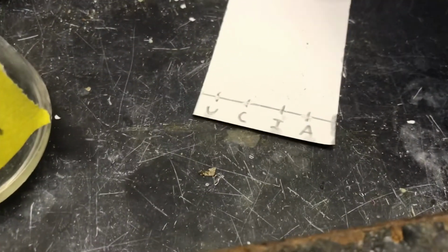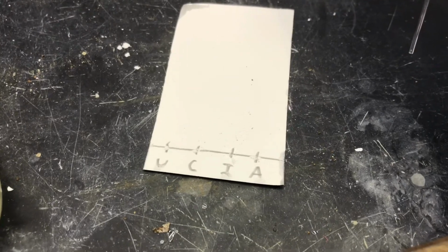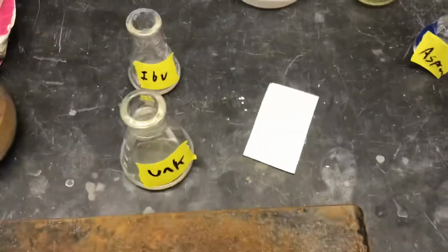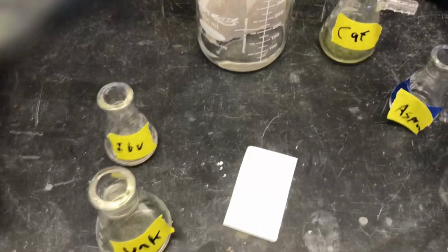Too much and you're going to have a big smear, and it's going to be difficult to tell exactly where it should be. Too small, you're not going to be able to see it. Just about a little bit smaller than the circumference of a circle that would be encompassed by that line right there. Now, real quick, I'm going to just buzz through adding the rest of the substances.